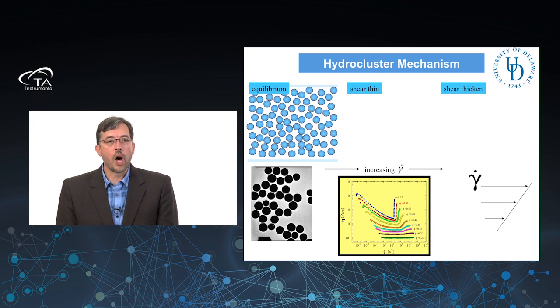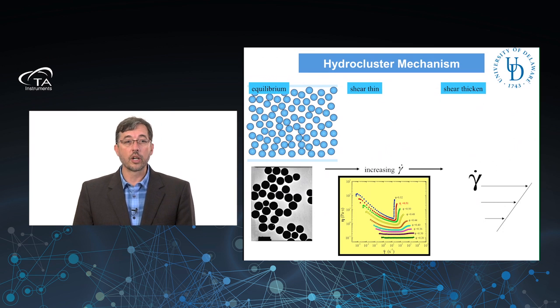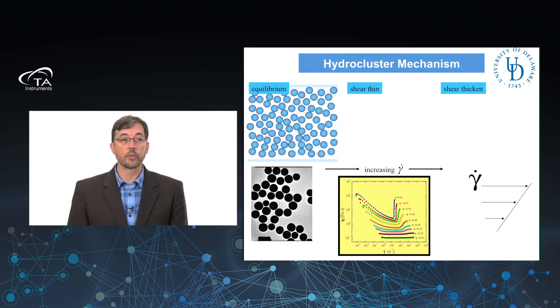Well, in the bottom yellow plot, what you see is some viscosity data taken on colloidal silica as a function of shear rate and volume fraction. You can see as I start off at the bottom, I have Newtonian viscosity that only weakly shear thickens, but you can see a very clear shear thickening transition at high shear rates. That seems to move to lower shear rates as I add more particles and eventually becomes discontinuous. That is, it doesn't reach a high shear plateau.